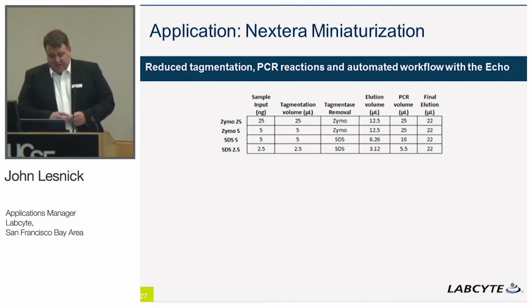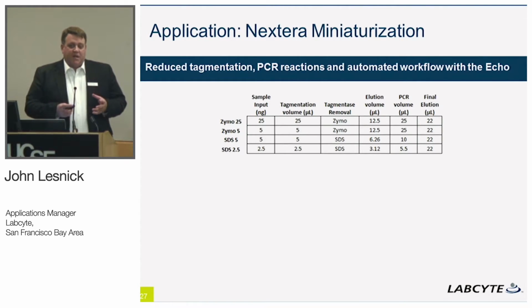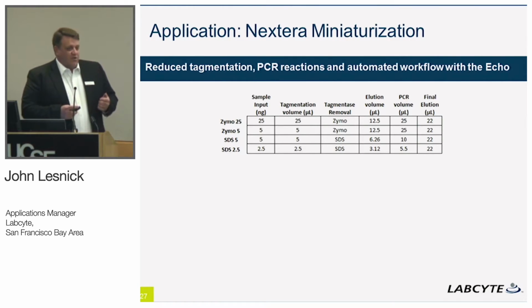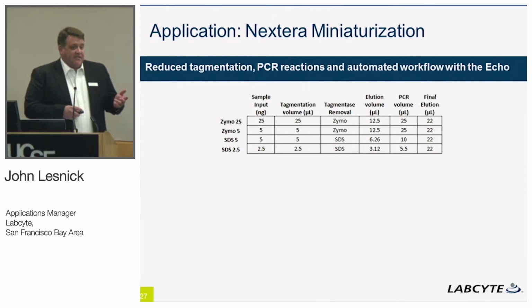So the assay design and setup really focused on 4 different libraries that were used. Within the Nextera kit, there is a Zymo cleanup step, and the Zymo cleanup step is a spin column, so it's not very automatable. What you want to do is try and eliminate that step so then you can run it a little bit more streamlined. The Zymo step is really meant to strip the DNA of the fragmentase or the tagmentase, or deactivate it. There was a paper in 2015, Pacelli, I think, and they detail the method to use SDS as an equivalent reagent to handle that tagmentase on the DNA.